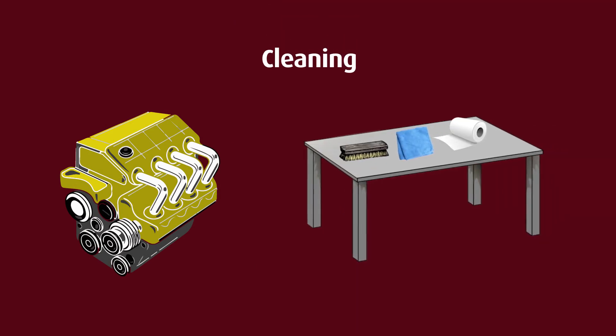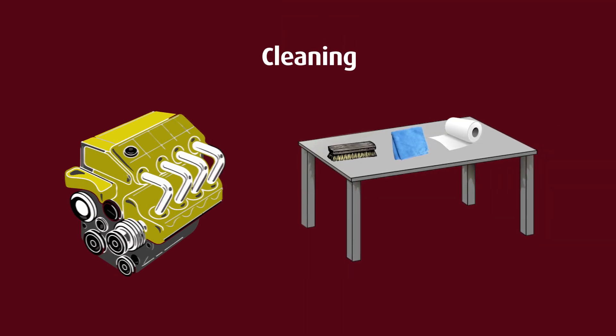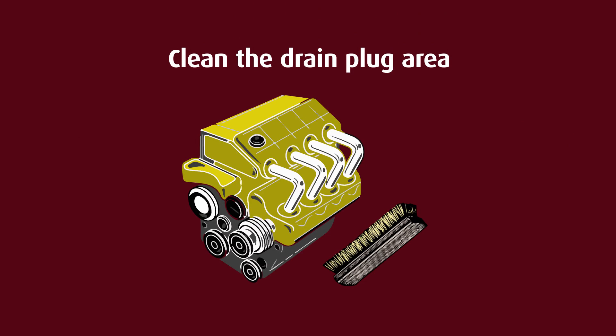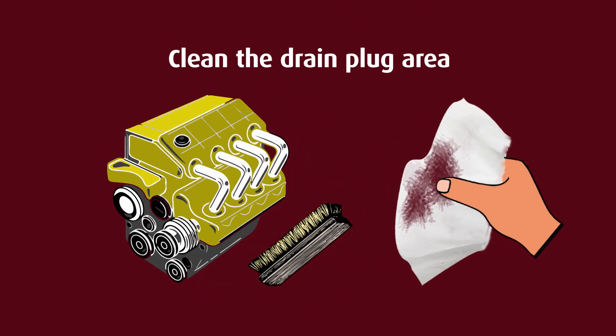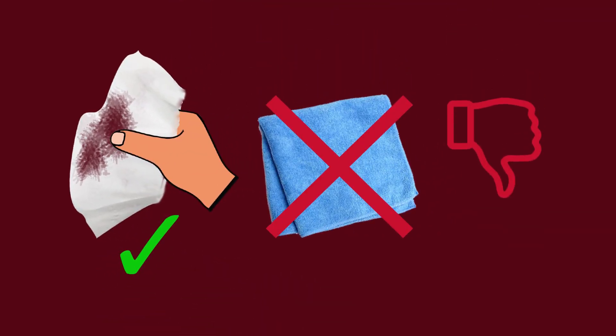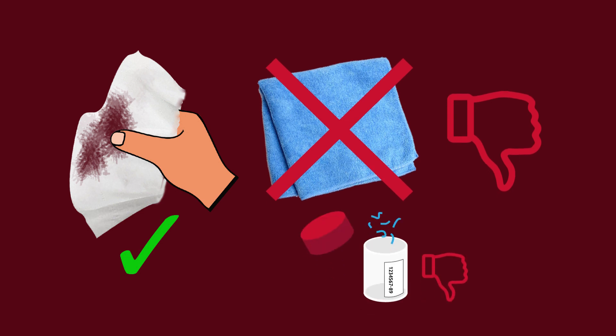Have a clean area around you where you can put your sampling tools. Scrub the area around the plug thoroughly with a wire or plastic brush to remove loose dirt, rust, and other debris. Wipe off with a clean paper towel — not a rag. This is similar to the sterile wipe that the doctor uses before taking a blood sample. Paper towels are preferred to rags: rags are usually dark in color, making it more difficult to see residual dirt, and rags can leave fibers behind. A bunch of fibers getting into the sample bottle could be interpreted as a collapsing filter.